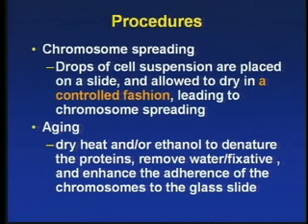The third step is called chromosome spreading, and this is the part that you're going to experience yourself later. We have done the other things for you. We have the cells already in the fixative, but you're going to do the real chromosome spreading.